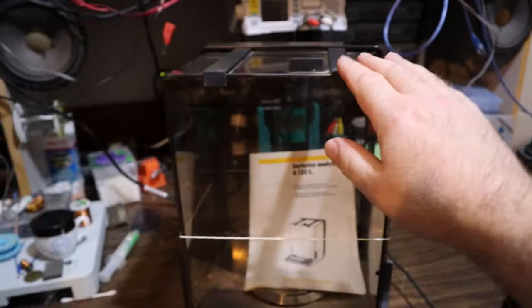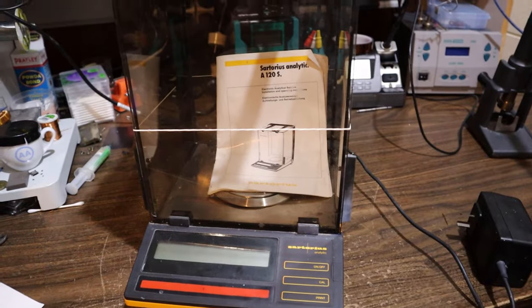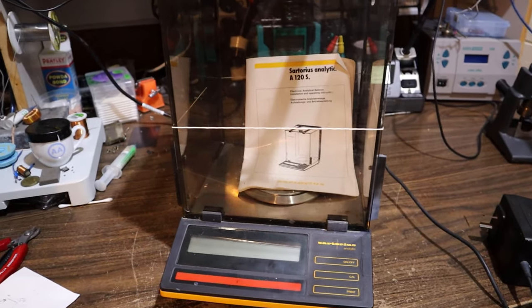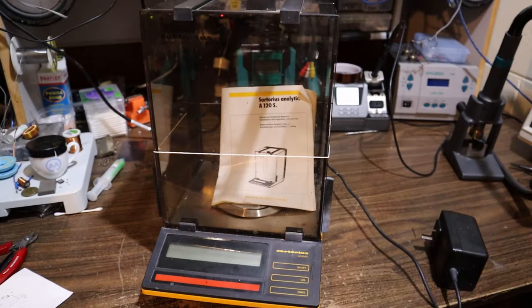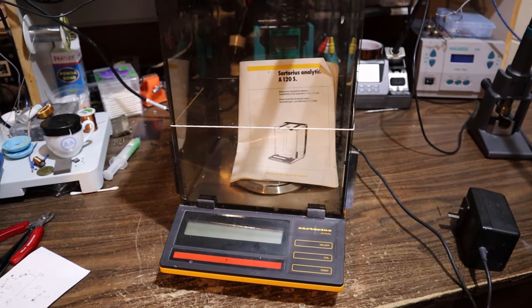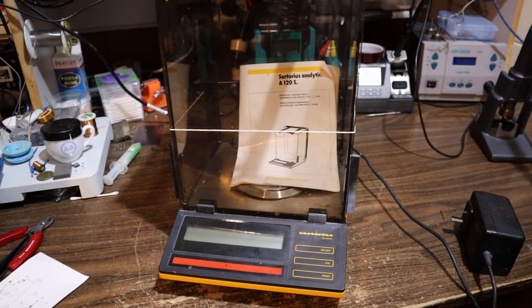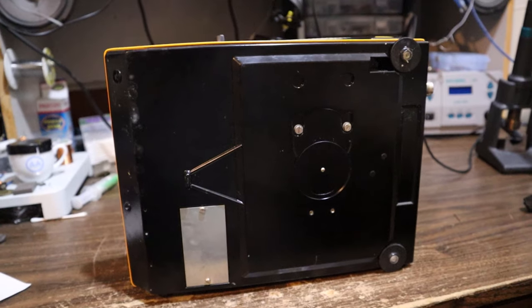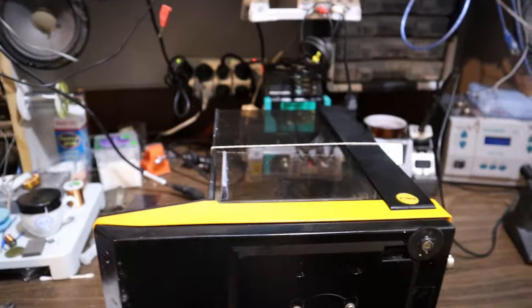It's got this neat little box around it. I understand the box is designed to stop wind currents and things from upsetting the measurements, because if you're measuring micrograms and someone farts across the other side of the room, you could probably see it fluctuate on your reading. It's not immediately obvious how it comes apart.